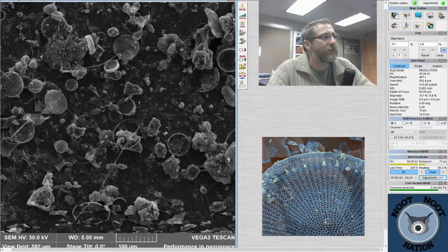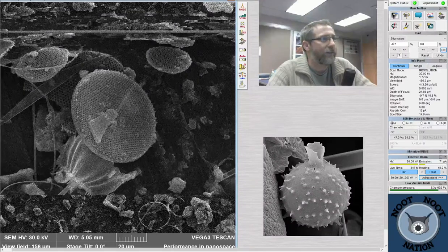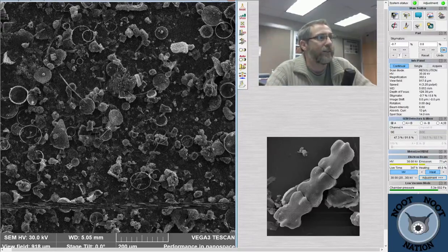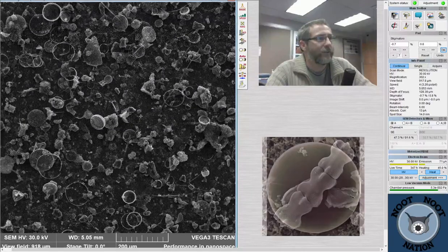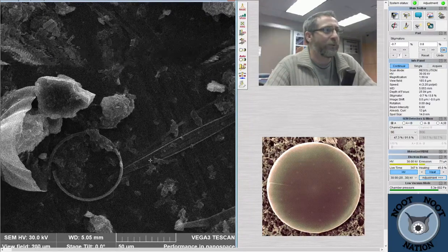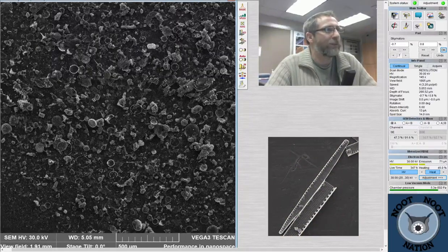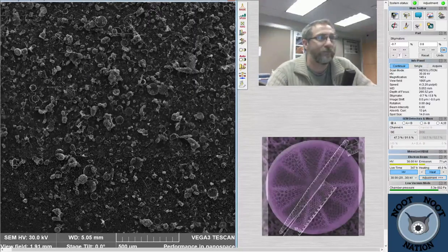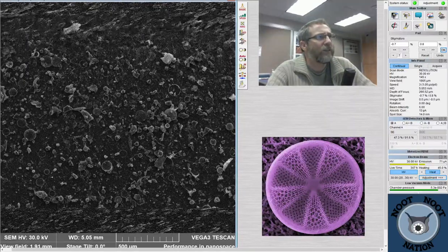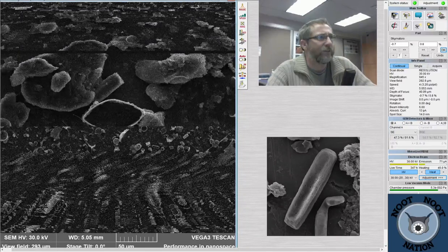Well, we've definitely seen some really pretty diatoms today, highlighted by the SEM, and I think that there's a lot of stuff here that we didn't get around to finding, which is always the case. There's never a time when I get 2 hours in on the SEM and I'm like, well, I think I've seen everything. Unless it's one of those samples that's basically monotypic, where there's nothing else in it but one species, which happens sometimes, but not in these marine ones. So it's sort of like an endless list of things we could look through.